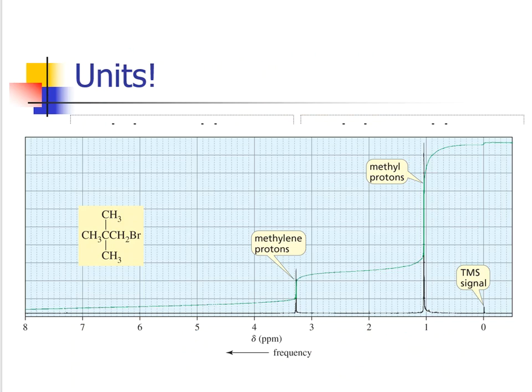Okay, so what you see on the computer screen now is an image of a real NMR, and notice there's not a lot going on here, right? On the x-axis, the 0 mark is here, and I see a very tiny signal right there, and that's from the TMS, which is good, and that gives me my starting point. That is my tare function. Then it looks like there's a line that jets all the way up and then comes all the way back down.